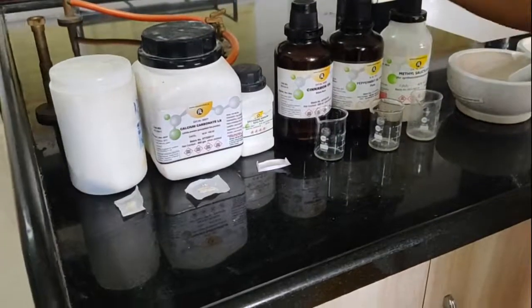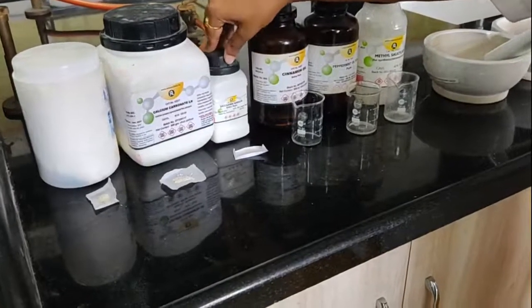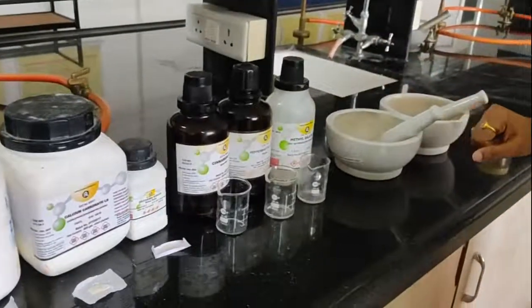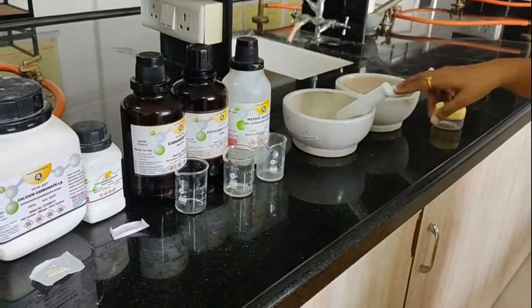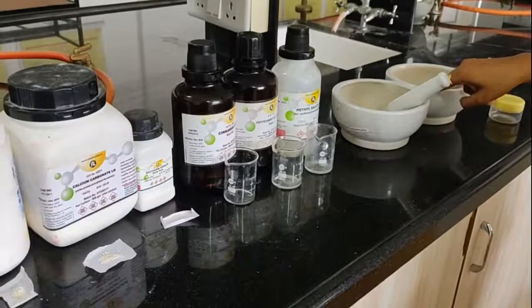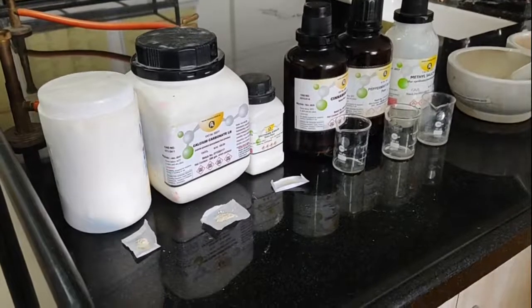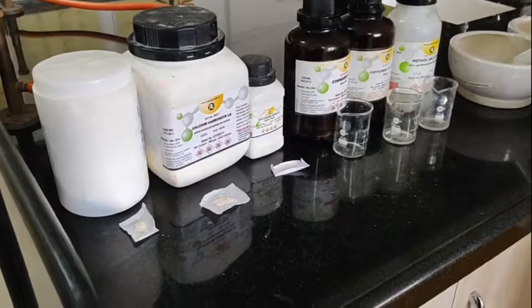So we have hard soap, calcium carbonate, saccharin sodium, then cinnamon oil, peppermint oil, methyl salicylate. All these are previously weighed. So now I am going to divide all the ingredients into two halves, into these two mortar and pestles, and after mixing properly in these two halves, we will mix the contents from these two mortars, and then we will proceed to the next part.